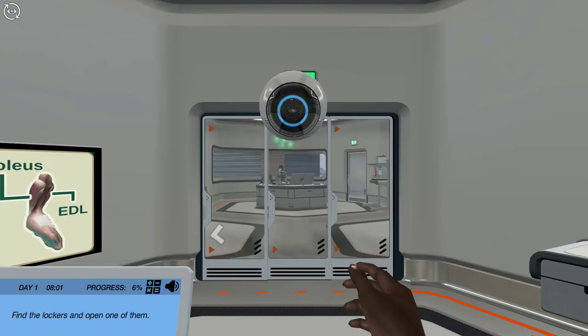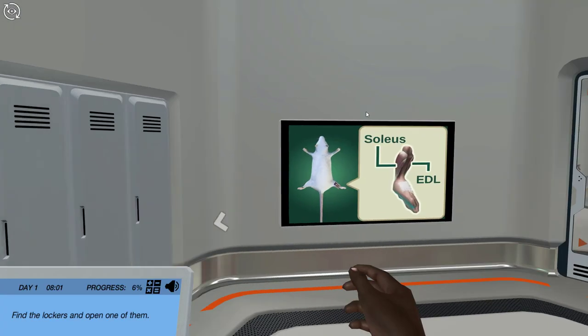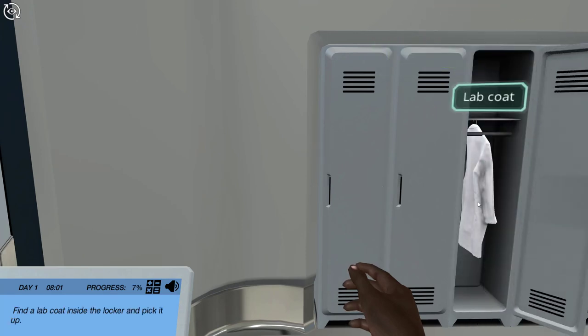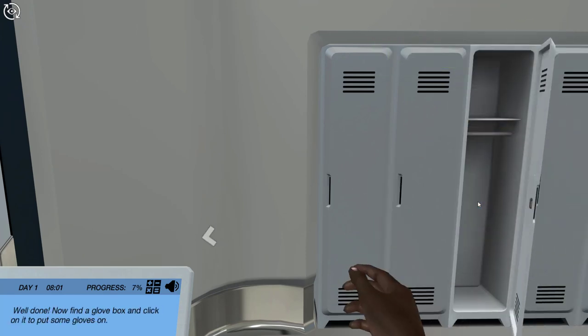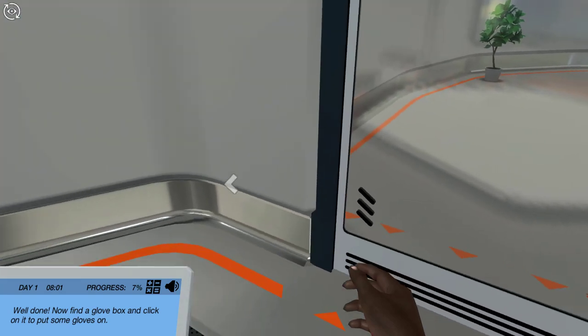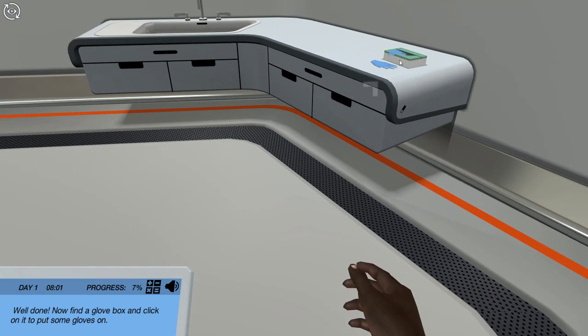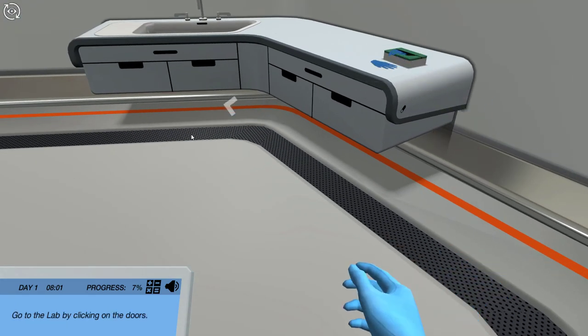Find the lockers and open one of them. Find a lab coat inside the locker and pick it up. Well done. Now find a glove box and click on it to put some gloves on. Go to the lab by clicking on the doors.